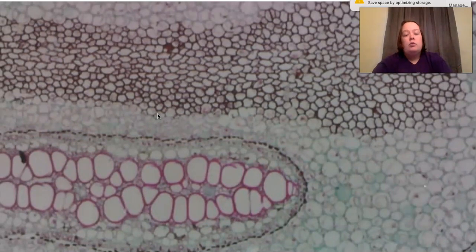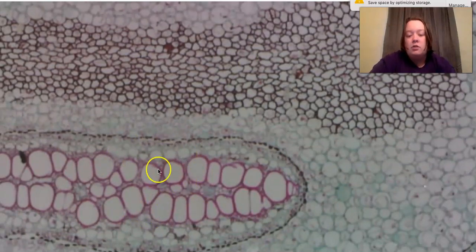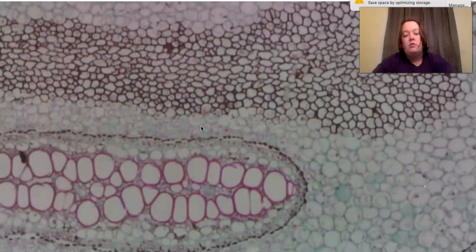So from what you wrote above, what do we see in this sample that tells us that these are plant cells? And again, make sure you look carefully both at the ones here. One of the features isn't so clear here, but it definitely is clear up here. So make sure that you're looking at both sections when you're answering this question. So what are at least 2 or 3 characteristics of plant cells that we can see in this image?